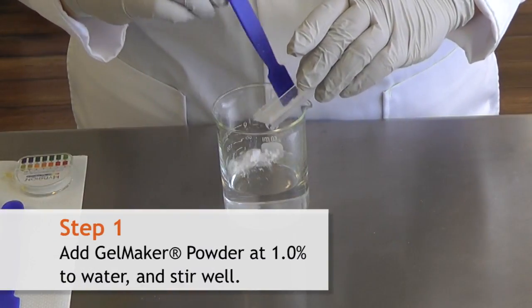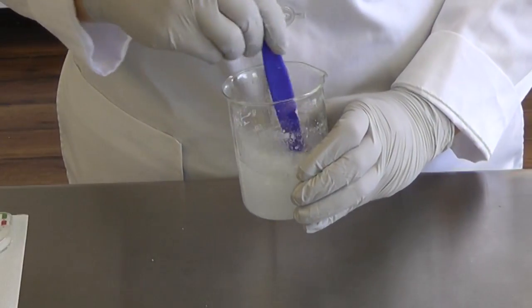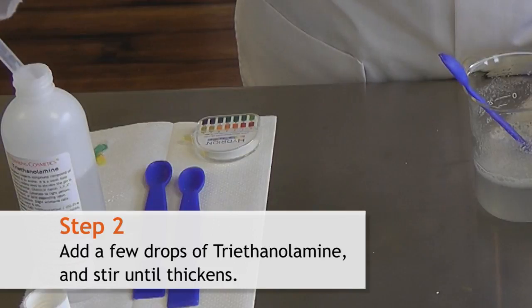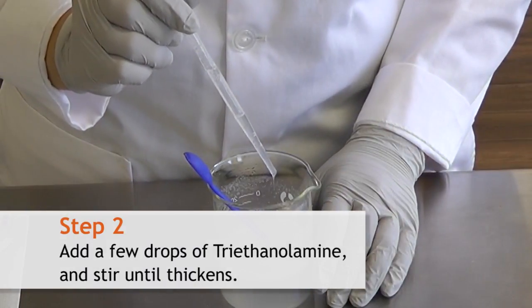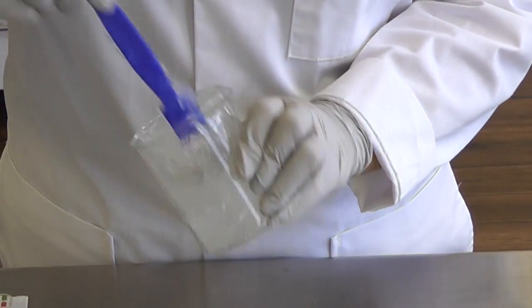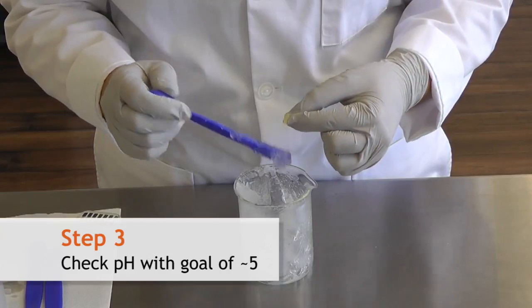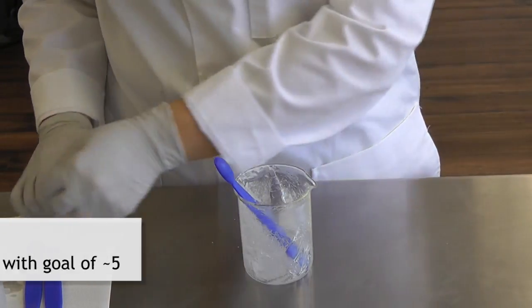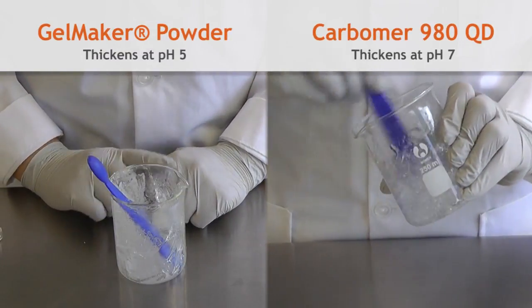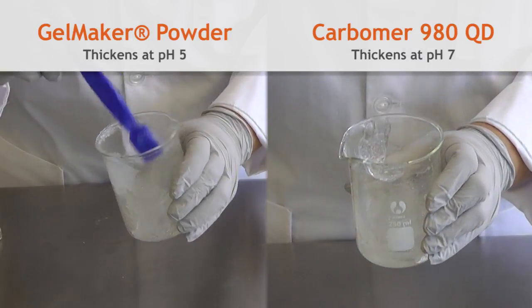First we're going to add our gel maker powder to our water. Notice that with stirring it is still a little bit cloudy and hazy. A couple drops of triethanolamine will fix this. We'll check the pH and see that it is around 5. The difference between the gel maker powder and our Carbomer is that Carbomer tends to thicken around a pH of 7, whereas our gel maker powder will thicken around a pH of 5. It also makes a very thick gel like that of Carbomer.